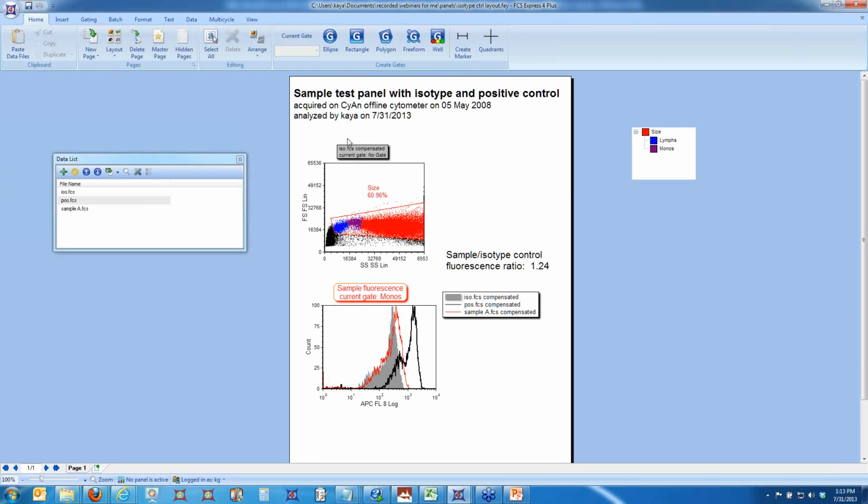So this just goes to show you that we can easily take any layout you might have created weeks ago and decide to convert it into a panel after the fact. So there's no need to enter into layout building with the premeditated notion of making a panel. You can just make anything into a panel at any time you want, okay?